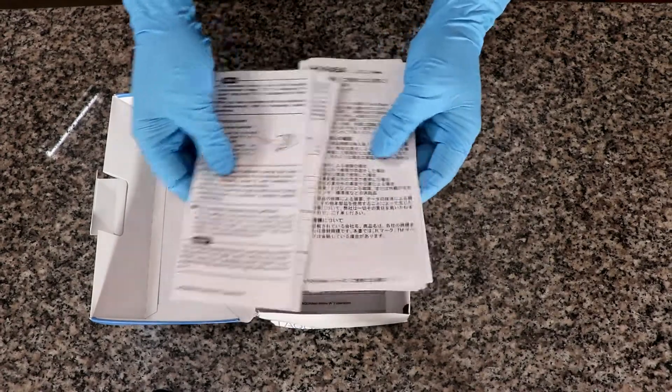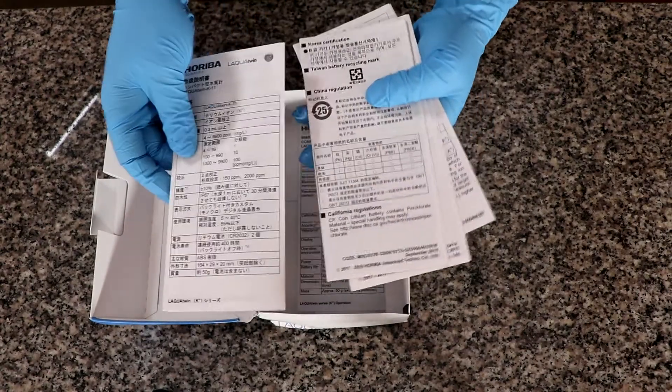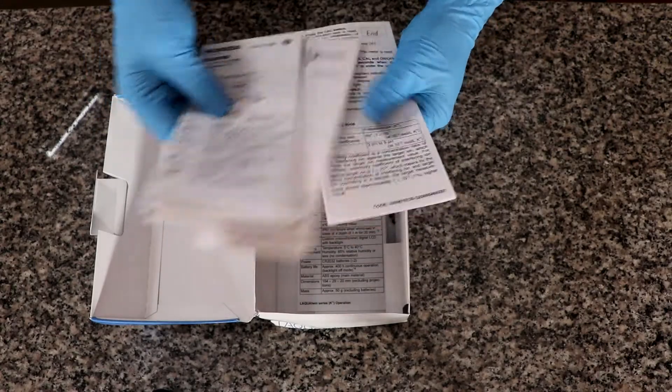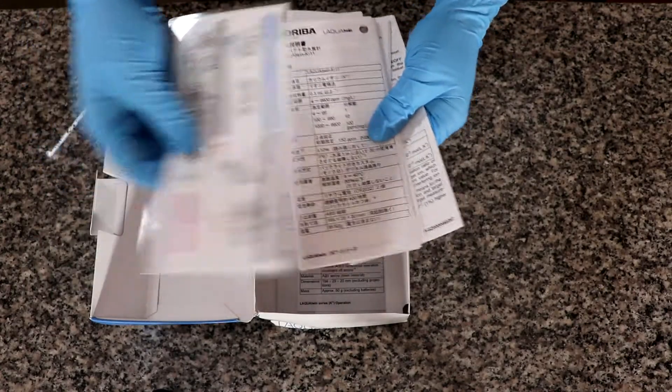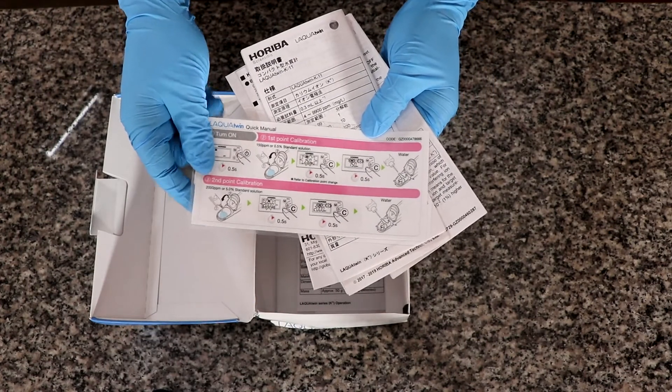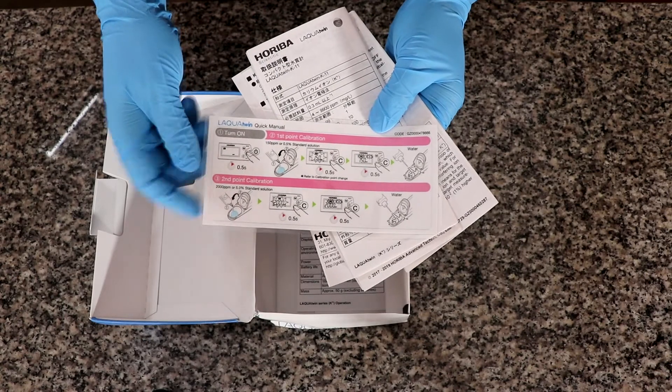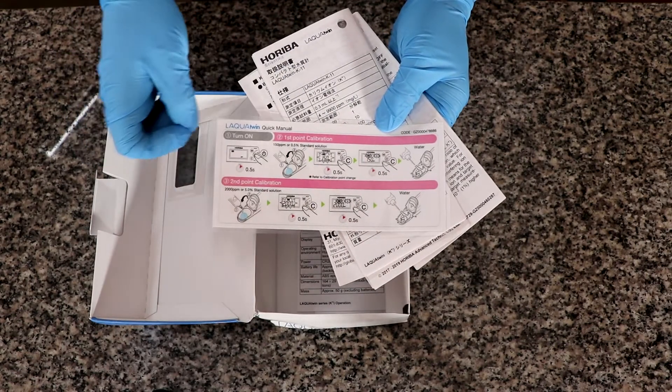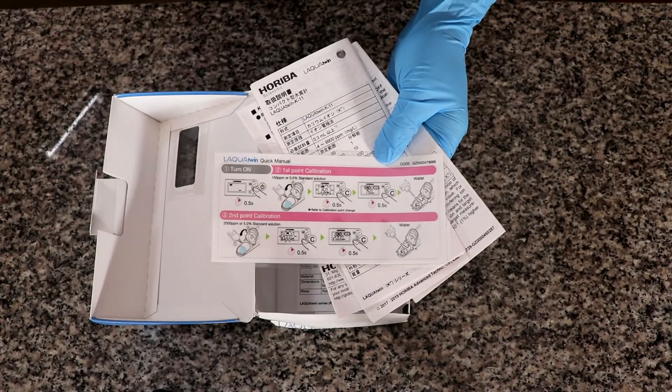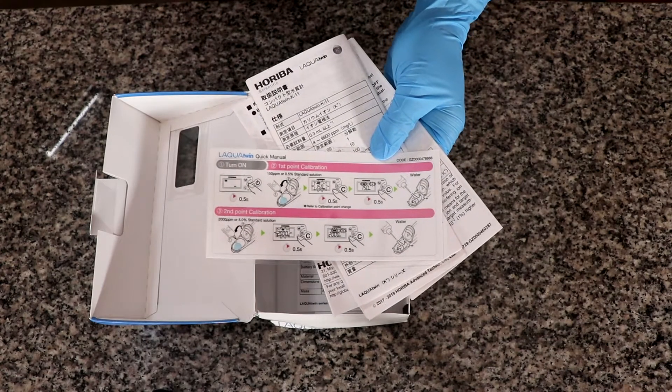This is the case and we have the instruction manuals which tell us everything we want to know about the electrode in Japanese and in English. We have this small guide which is a quick start guide that is also laminated so you can have it while you work and use it as a reference, for example to perform the two point calibration process that we will be performing shortly.